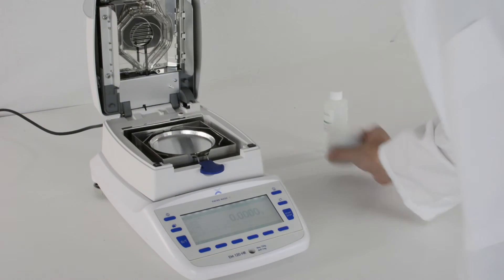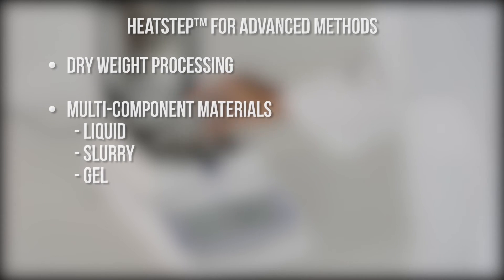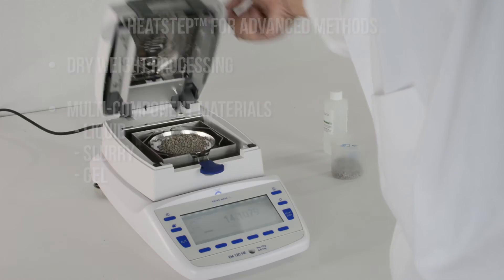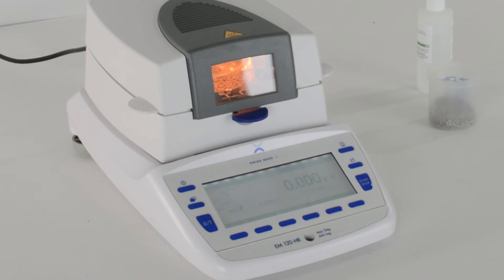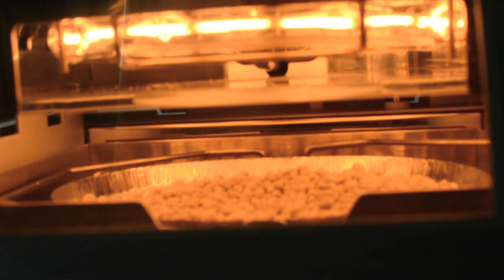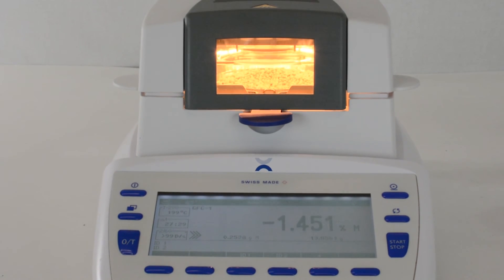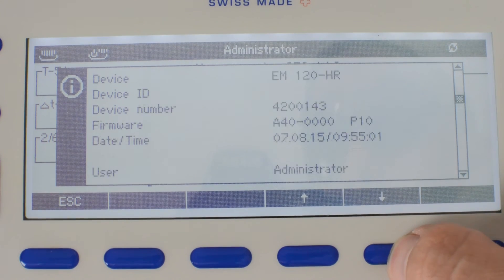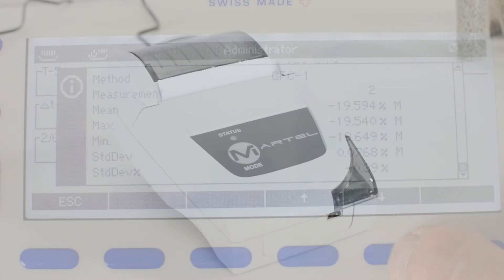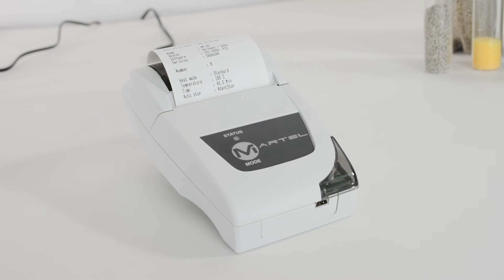The EM has three programmable heat steps for advanced methods that include dry weight processing or multi-component liquid, slurry, and gel material. Using heat steps, the balance will heat the sample at a user-specified temperature and time limit, then automatically proceed to heat the sample at a new user-defined temperature once the previous time limit has elapsed. When the process is finished, the results will appear on screen and can output to an optional RS-232 connected printer or your computer software.